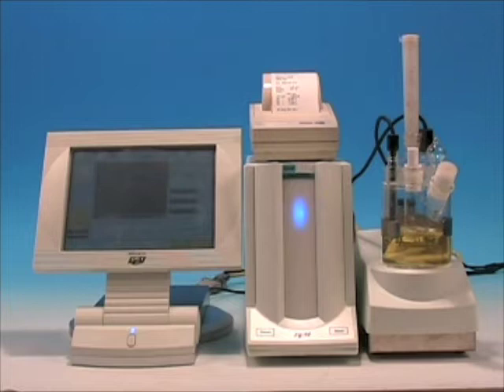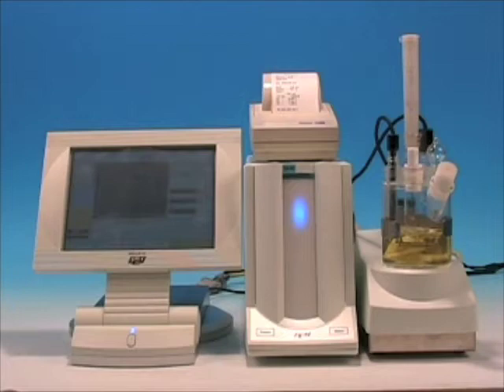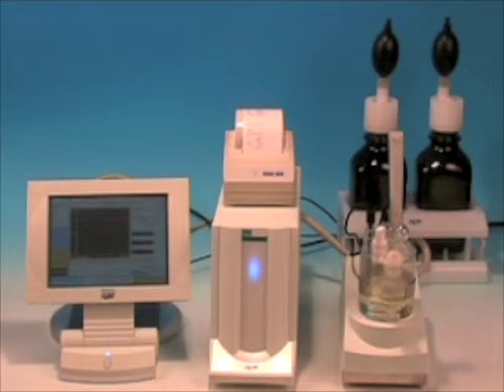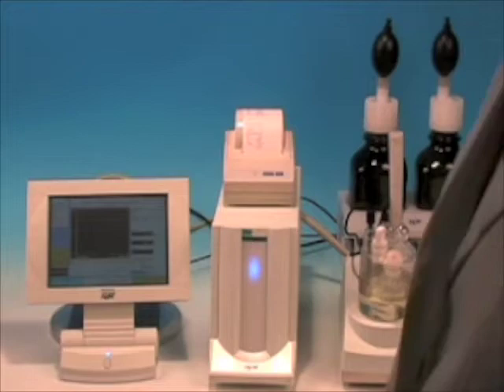The 600 series titrator developed by KEM incorporates state-of-the-art technology including touch panel screen operation. This is the MKC610 Coulometric Karl Fischer titrator.